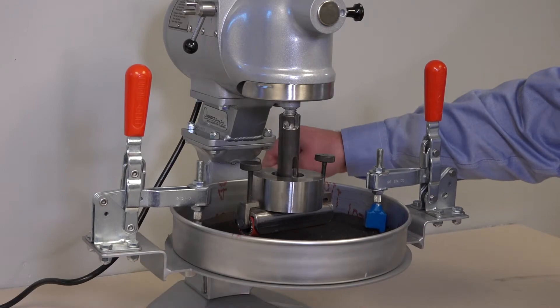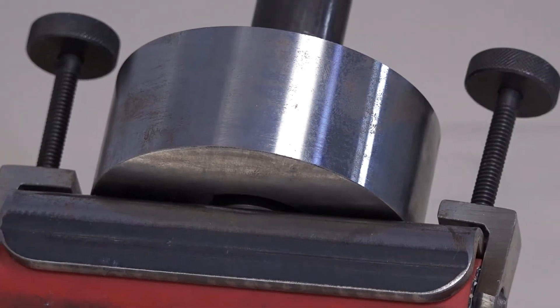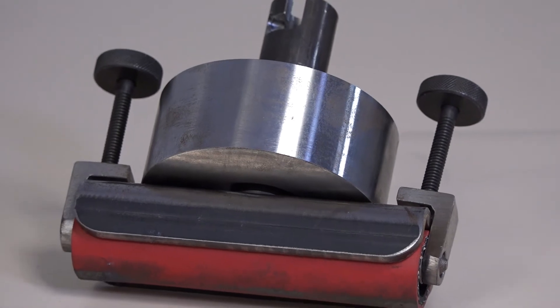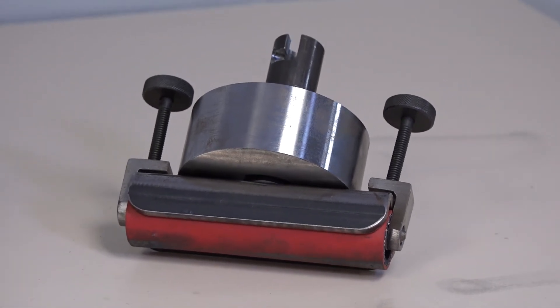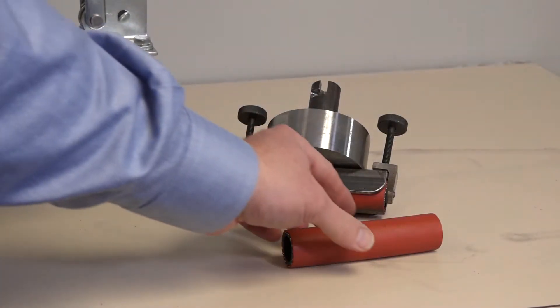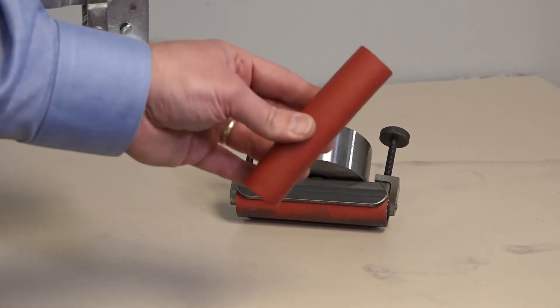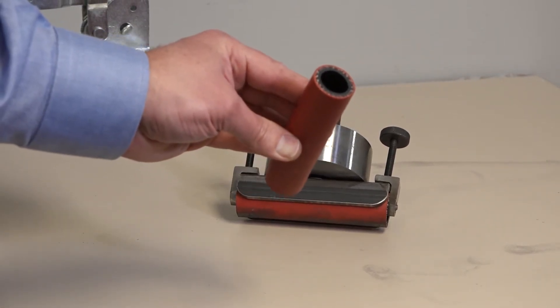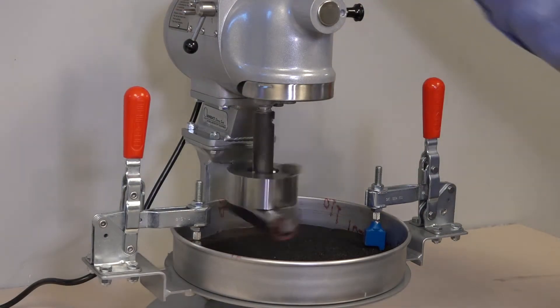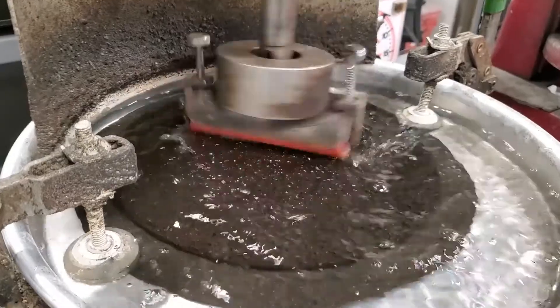The sample is then locked in place and the head is lowered. The head is constructed of a specified weight with a specified hose that contacts the sample. The specified weight controls the downforce on the sample, and the rubber hose is used due to its similarity to a vehicle tire. Now we're ready to start the test, and the head abrades the sample with its planetary motion for a defined period of time.